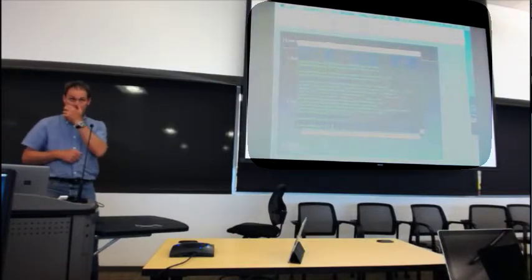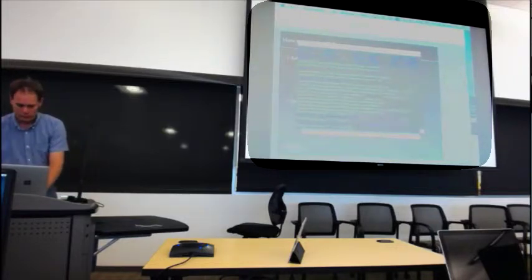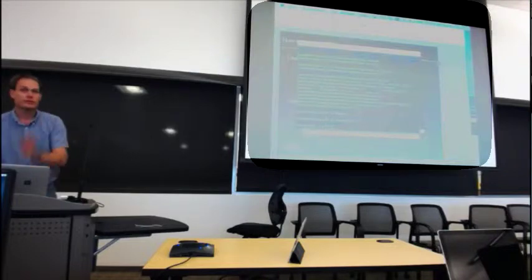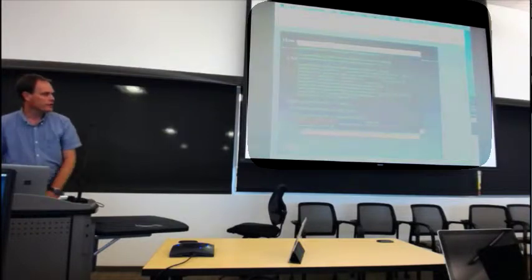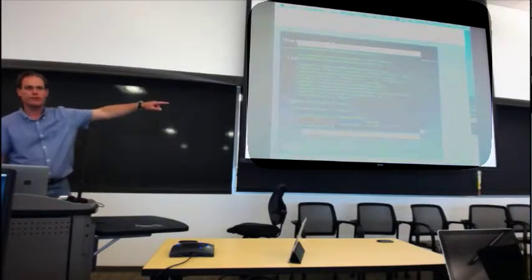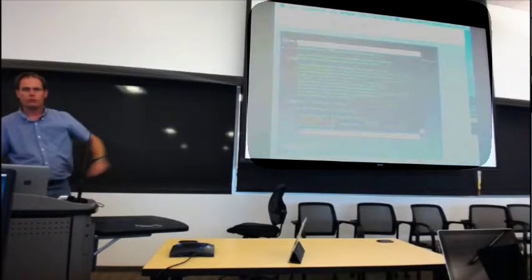That's where CASS, CCTBX, etc. live. CFEL, we've got a directory in there for the software that we maintain, and there's CrystFEL's standard installation in there, and there's also Cheetah's standard installation in there, and that's where you find the setup.csh, setup.sh templates, and these XFEL workshop things.